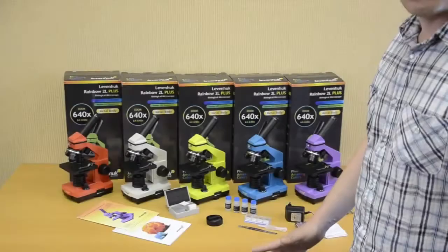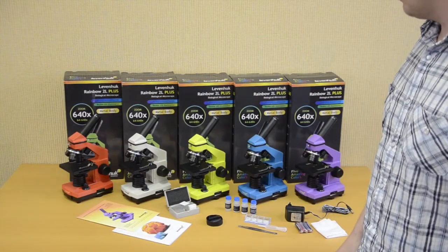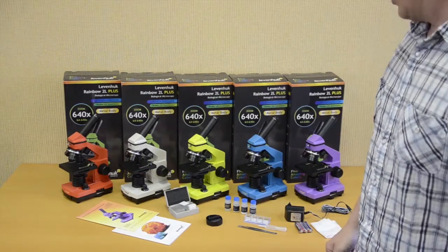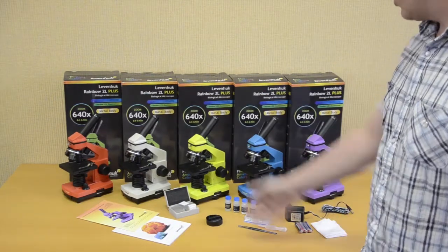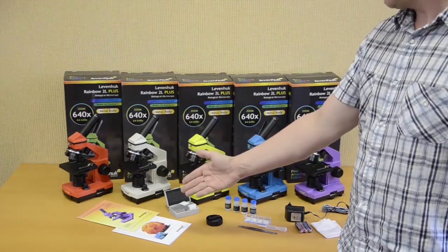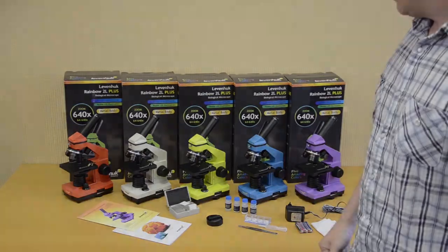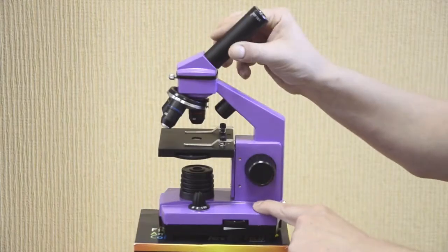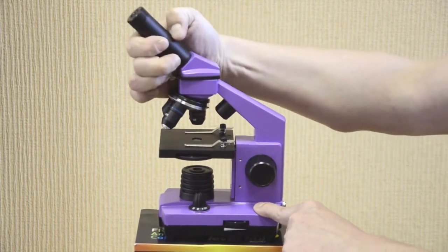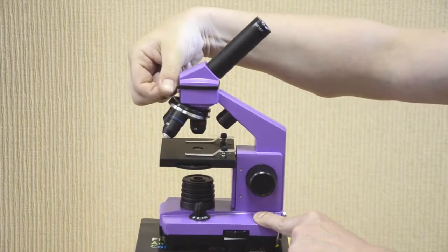Now it's time to present the Levenhuk Rainbow 2L Plus series of attractive color microscopes for children and students. The series color palette includes 5 colors. Each microscope is supplied with an experiment kit, prepared slides, and user manual, all packed in a wonderful bright gift box. The monocular head is inclined at 45 degrees, is 360 degrees rotatable, has two working positions, and is locked with a screw.